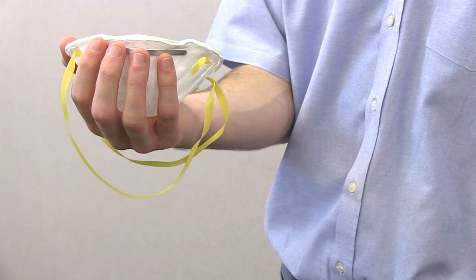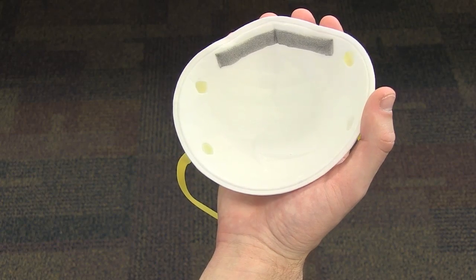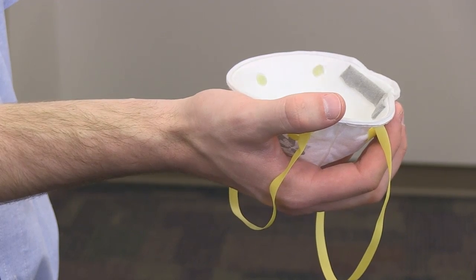To make sure the respirator will fit properly when you put it on, first cup it in your hand, holding the metal nose piece in your fingertips. Allow the straps to hang down freely. Position the respirator on your face so that the nose piece meets the bridge of your nose and the bottom covers your chin.